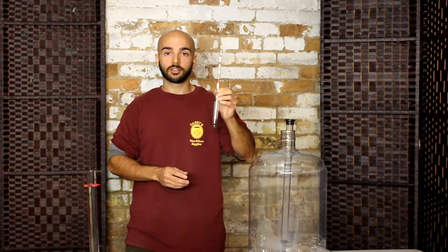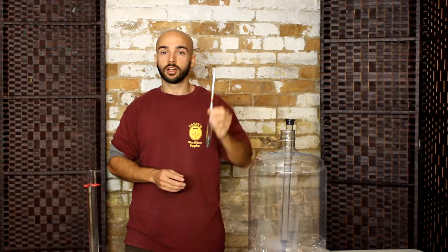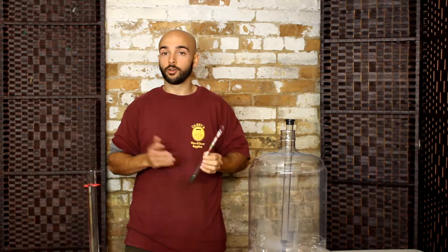Hey there guys, this is Nick from Danny's Wine and Beer Supplies, and in this video I'll be talking to you about a hydrometer and how it's used. A hydrometer is a glass tool that's used to measure the sugar content and potential alcohol of your wine or your beer.